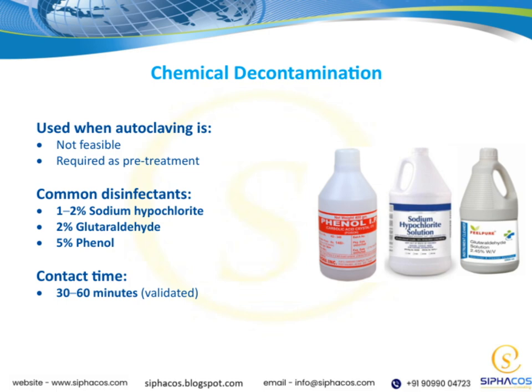It's important to note the contact time needed for these disinfectants to be effective. Usually, a period of 30 to 60 minutes is recommended, and this has been validated through research. Ensuring adequate contact time is crucial for the disinfectants to work properly and to guarantee safety.